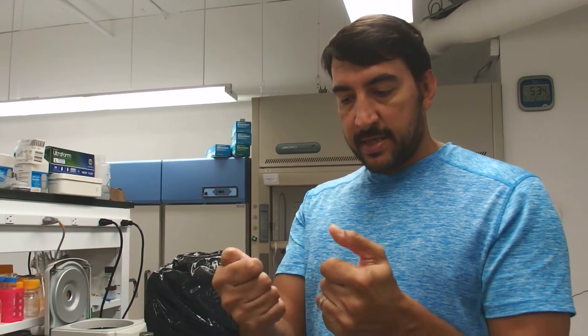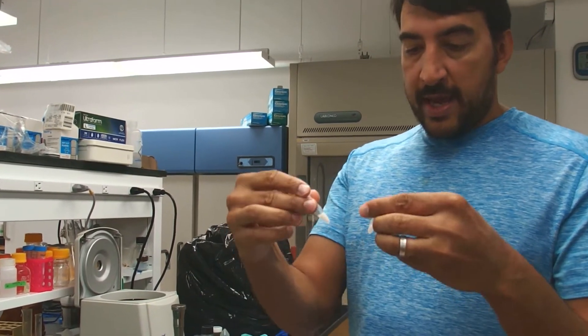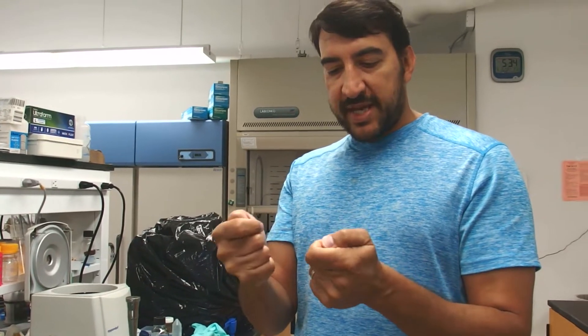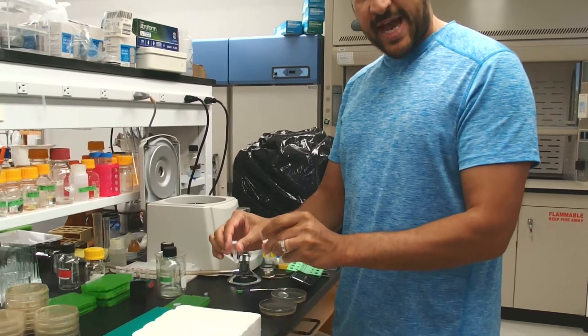What we want to do is we want to warm them up so that they begin to thaw in our hands. If there are any droplets on the sides of the tubes, we want to flick that down. The goal here is we want to warm them up until they just begin to thaw, and then we're going to put them directly onto ice.